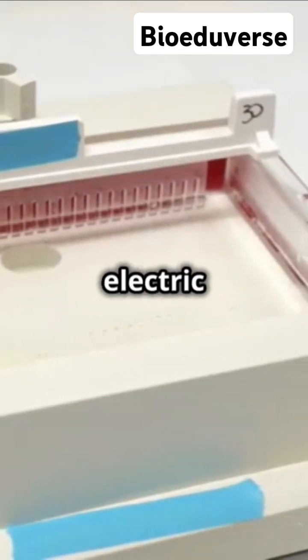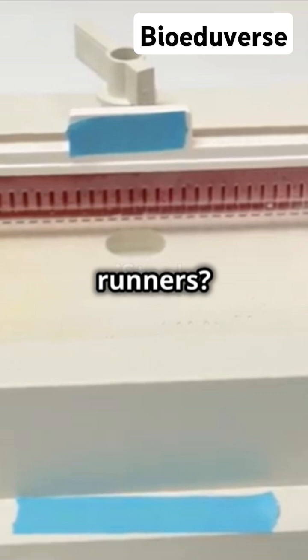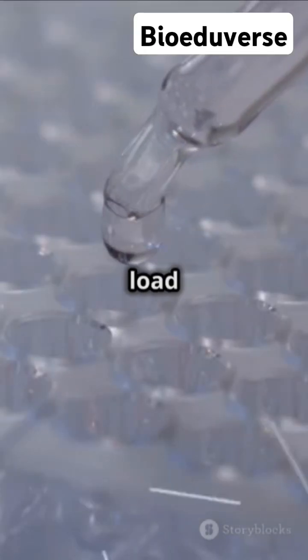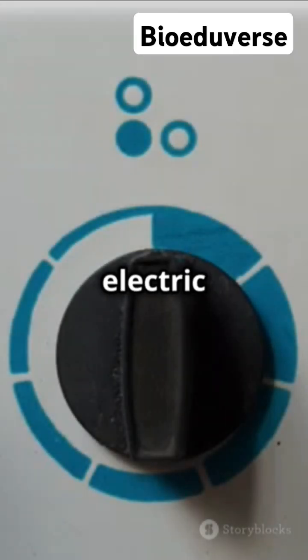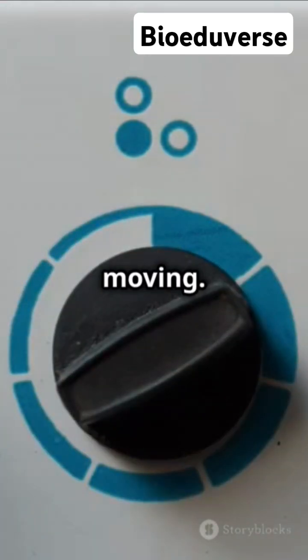First, we load our samples into wells — tiny pockets in the gel. When we turn on the electric current, these molecules start moving. Why? Because DNA and RNA have a negative charge, so they head towards the positive end.